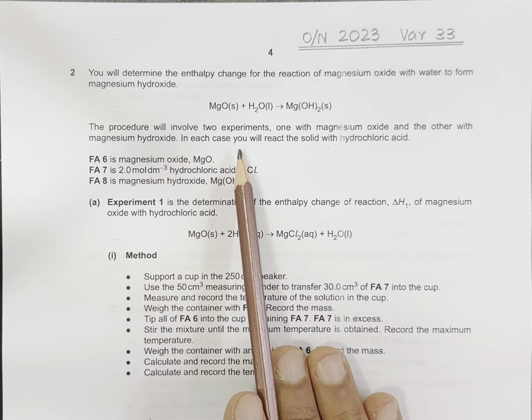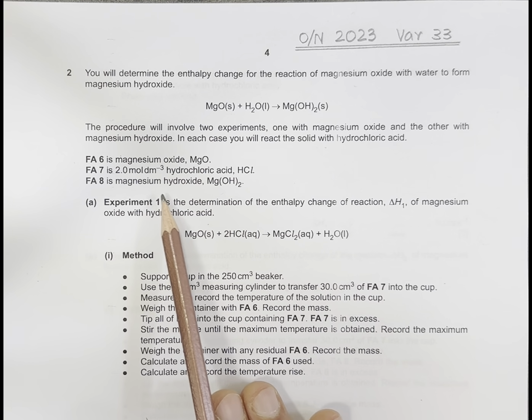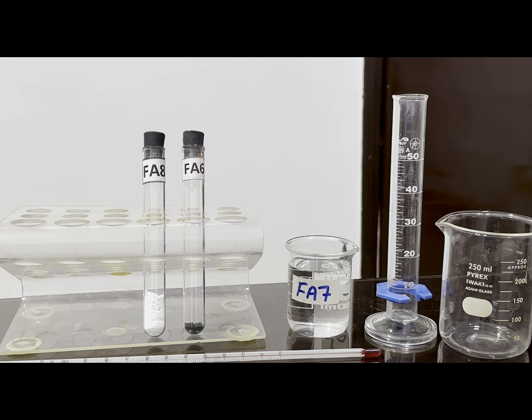The chemicals given are FA6, magnesium oxide; FA7 is 2 molar hydrochloric acid; FA8 is magnesium hydroxide. FA8 and FA6 are solids and FA7 is an aqueous solution.